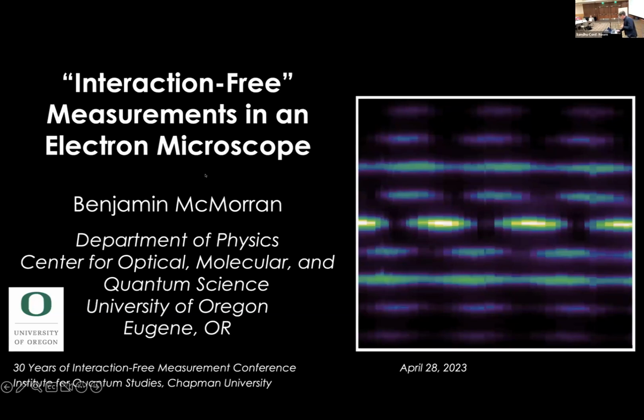So today I'm going to talk about our work with interaction-free, which I put in quotes just to appease everyone, measurements with electrons and an electron microscope. The data that I'm showing here is the output in multiple ports from an electron Mach-Zehnder interferometer. So I'll discuss how we did those experiments.